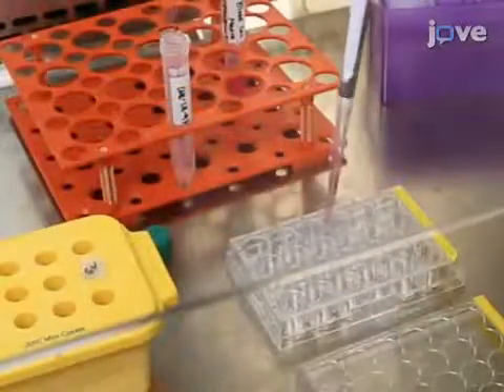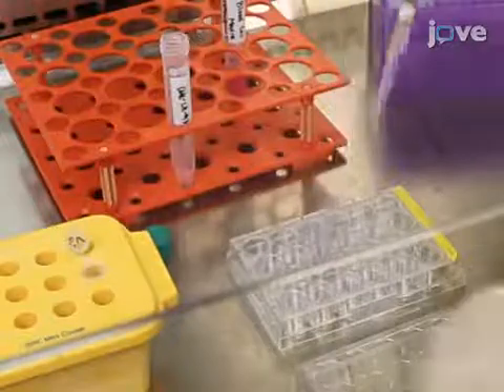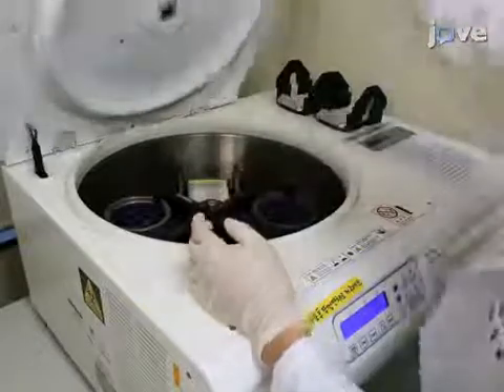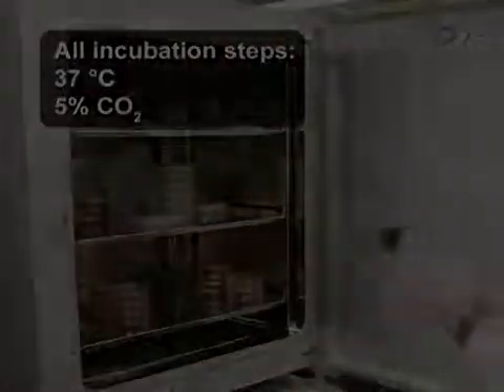Next, transfer the cells to a well on a non-coated 24-well plate and add the Sendai virus mixture following the manufacturer's recommendations. Centrifuge the plate for 30 minutes at 1,150 x G and 30 degrees Celsius. After centrifugation, incubate the cells overnight.